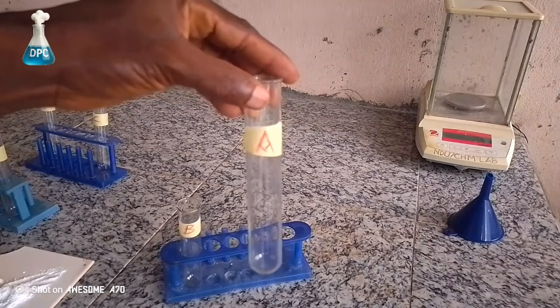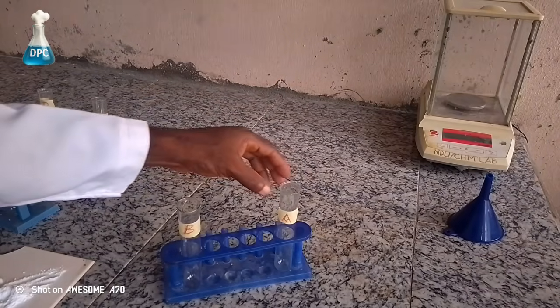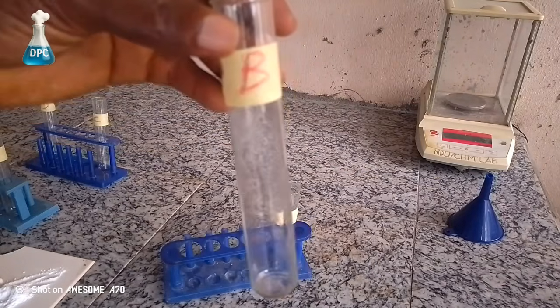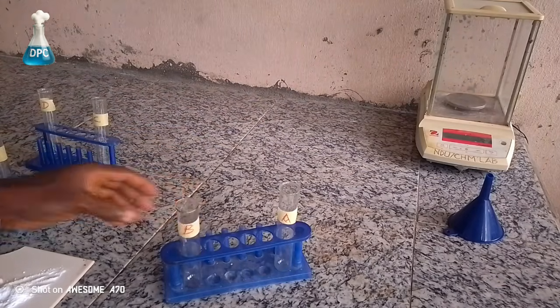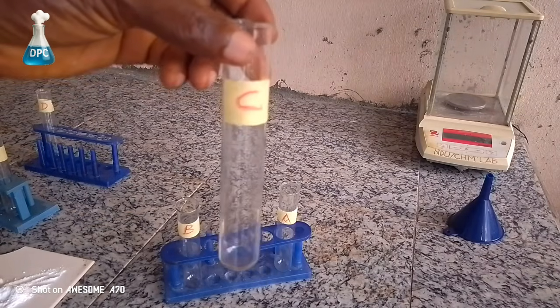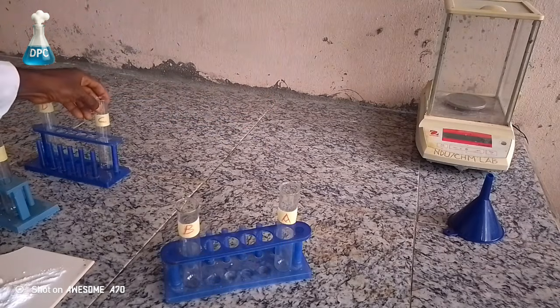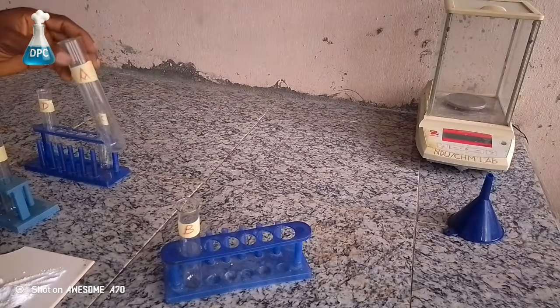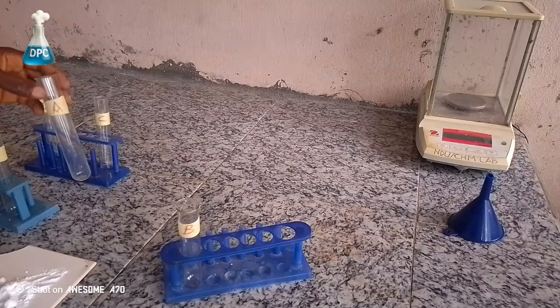Test tube A will contain 3 spatulas of sodium hydrogen carbonate, which is also called sodium bicarbonate. Test tube B will contain 1 spatula of sodium hydrogen carbonate, while test tube C will contain half a spatula of sodium hydrogen carbonate. We can now put the sodium hydrogen carbonate into the various test tubes.